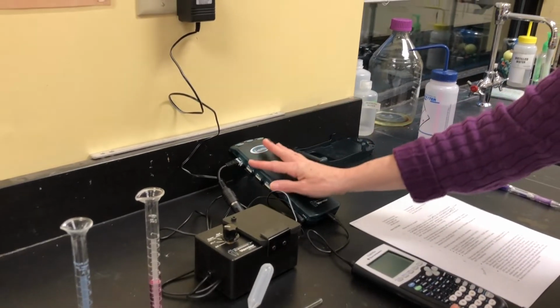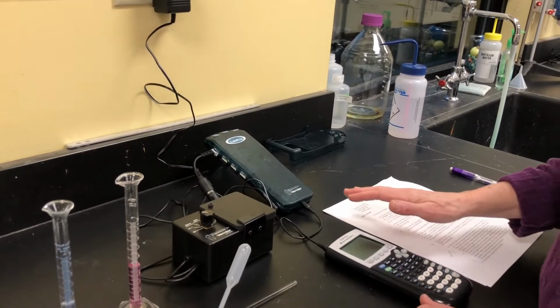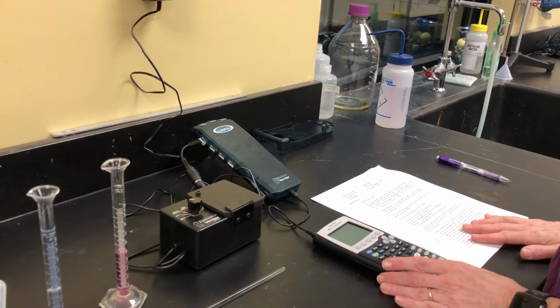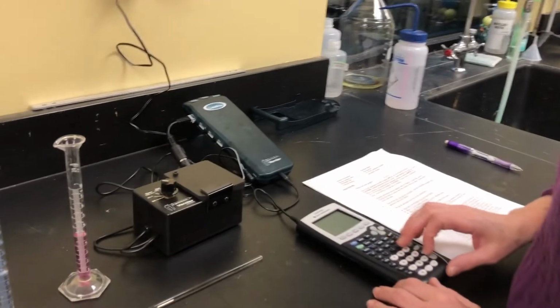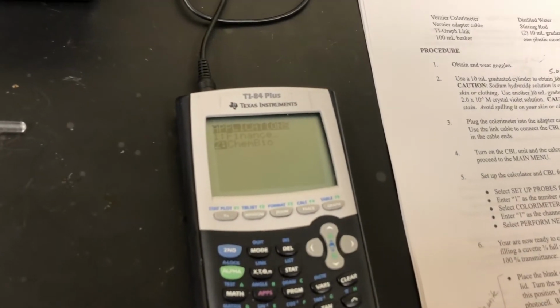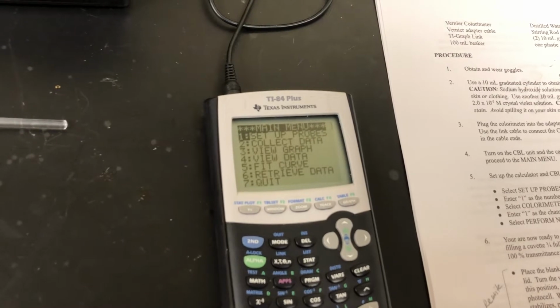And then we have this LabPro software that is essentially an interface between the colorimeter and the TI calculators. And in order to calibrate it, we have to be very careful with our settings. So what we want to do essentially is turn on the TI calculator. We want to push the apps button, and then we want to pick the ChemBio program. So that's how we want to start it, and that'll start the Vernier software, and then we hit enter to actually enter the software.